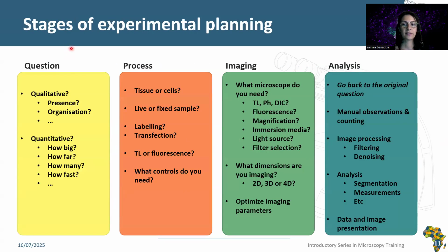So these are the different stages of the experimental plan. The first is, what is your question? Is it a qualitative or quantitative question? What parameters are you interested in? Big, far, many, how fast?